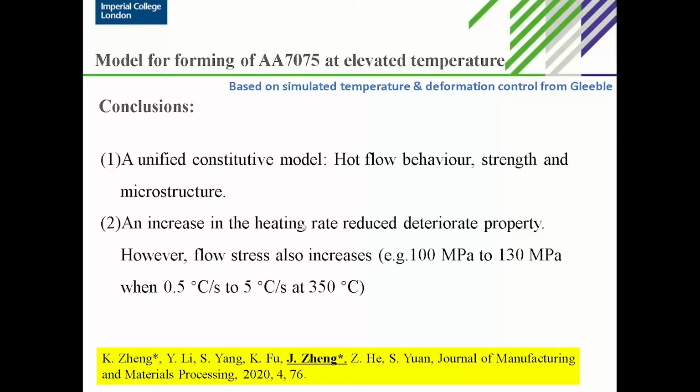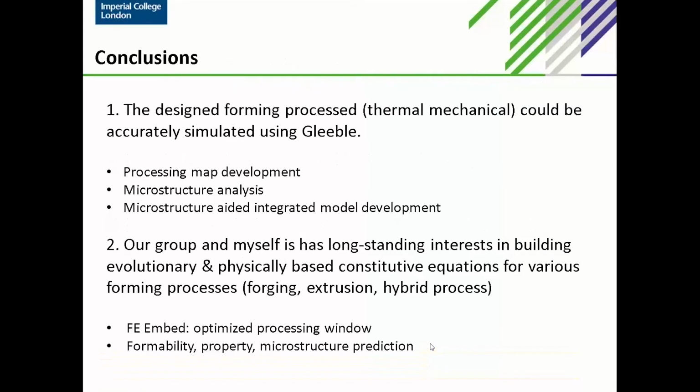The second is we examined the heating rate effect on the final mechanical properties, and also the heating rate effect on the flow stress behavior at different temperatures and strain rates. The details of this work could also be found in the paper below.